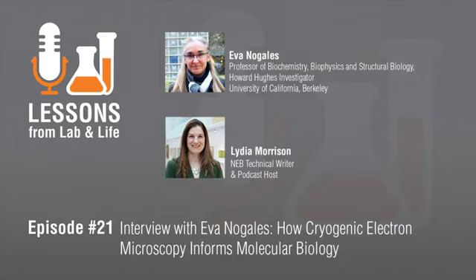I think so too. Can you tell us about the story of your work on TFIID? So TFIID stands for transcription factor that works with polymerase II. And the D, I understand, for the person that discovered it was just the order. Things were being discovered and being called A, B, C, D. In any case, this factor is actually a complex of about 14 different proteins. It has a huge size at the molecular level, 1.3 megadaltons.